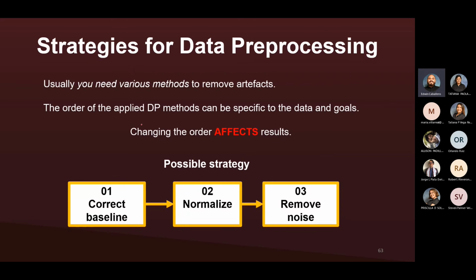Okay, so strategies with regards to data pre-processing. Firstly, I would never use more than 3 different pre-processing methods at the same time for the same data.